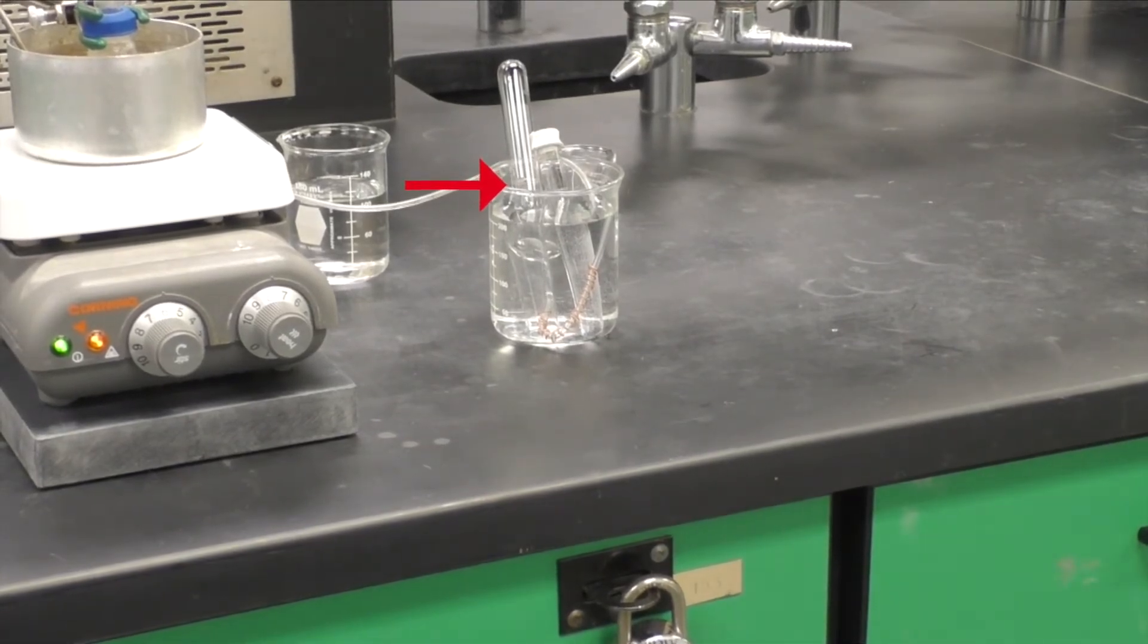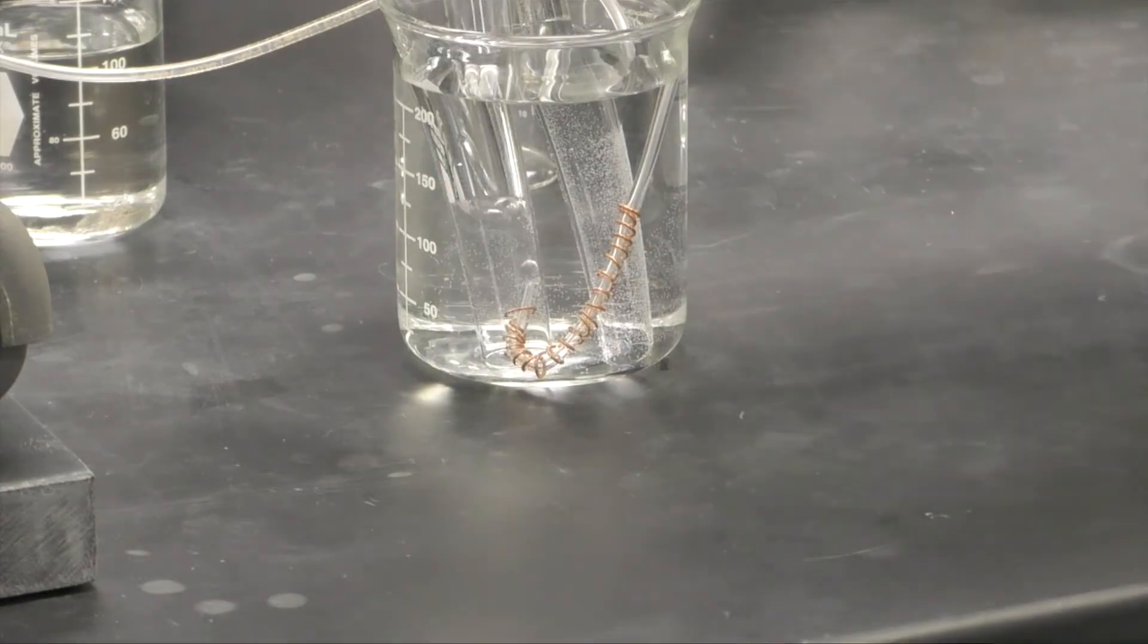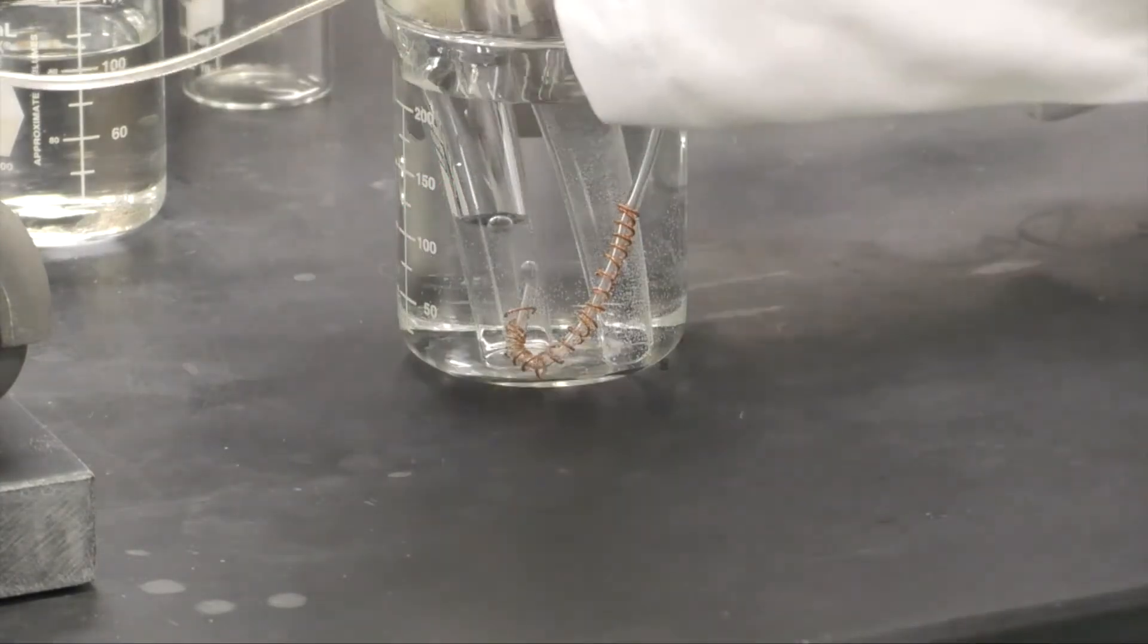When the column of gas gets to about 1 inch from the bottom of the test tube, remove it.